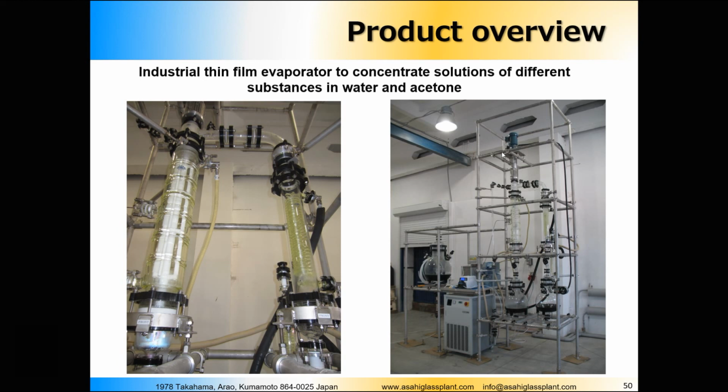Another point, by the way, which is important, a small thing, but very important for a convenient operation, is this little knob here. By default we have the drive here on the top, and the problem again was the control of the speed.